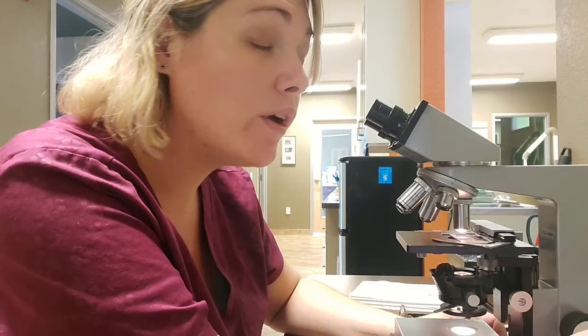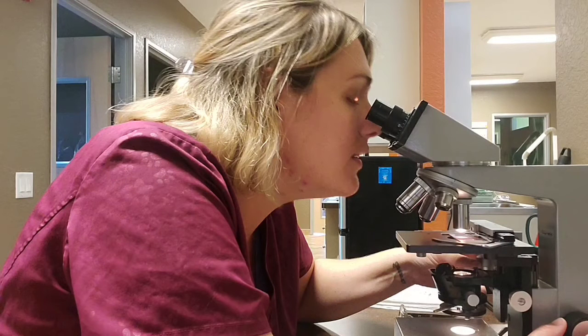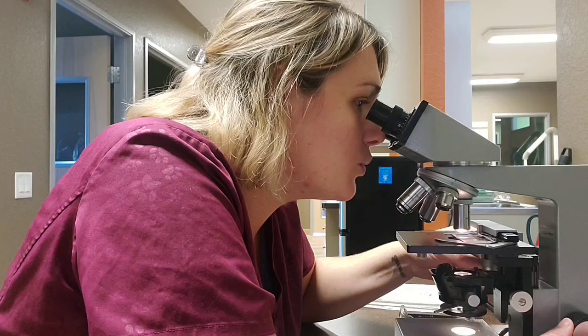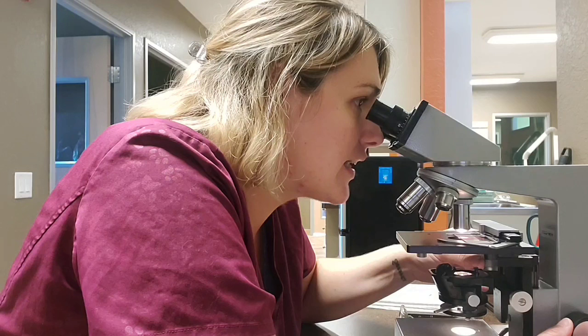We want to make sure that we are checking at least 10 fields for anything, and then if we do find something, we definitely want to attempt to state how many are on the entire slide, awesome. If not, we want to come up with an average or so to get an idea of what we have.